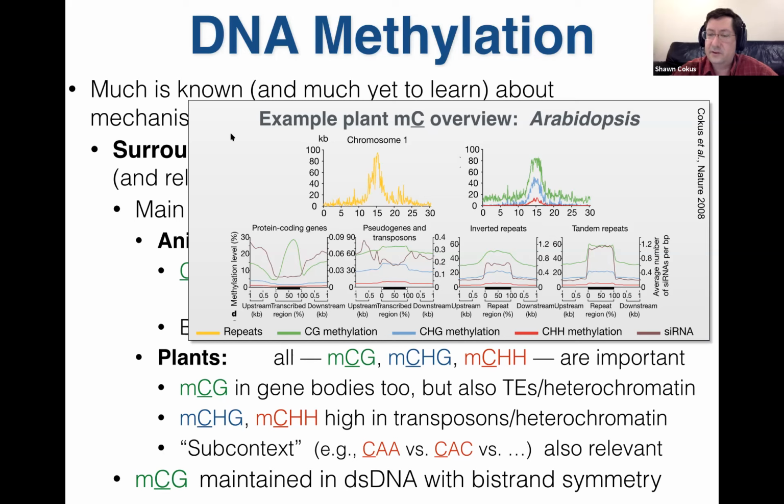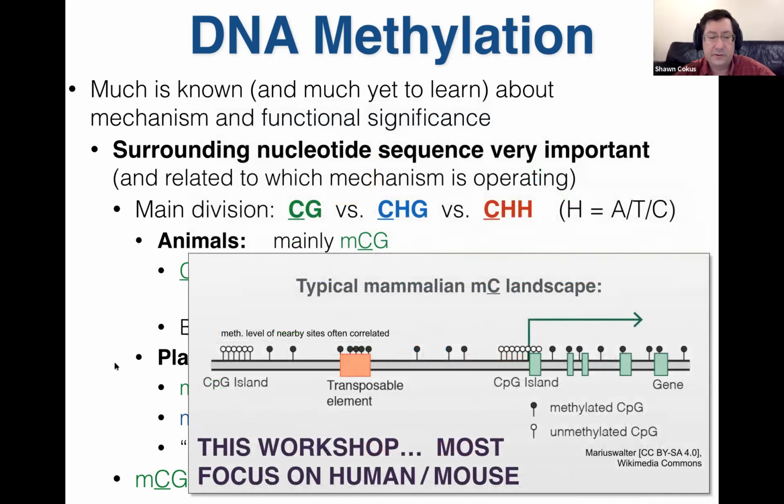So you should think of the variation as relative to the extremes that it takes. That CHH level looks low there, but in terms of the genome and individual places, that's as high as it gets, and that's a high CHH place at the centromere. You see the gene body methylation CG in the bottom left corner there, and you also see the various TE elements and so on get all 3 marks. In animals, your typical local landscape looks something more like this.